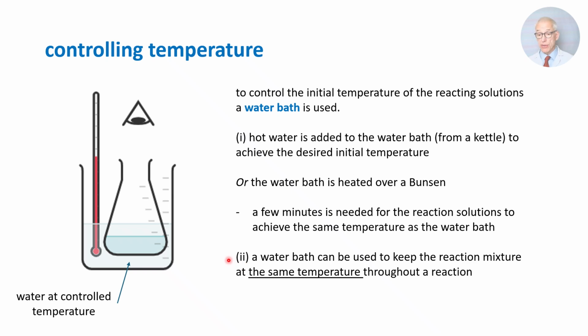Now, a water bath is also used to keep the reaction temperatures the same throughout a reaction. For instance, if a reaction is exothermic, and you're trying to investigate the effect of concentrations on the rate of that reaction, it might be a good idea to keep the temperature of the reaction mixture constant throughout the experiment. That can be achieved with a water bath.